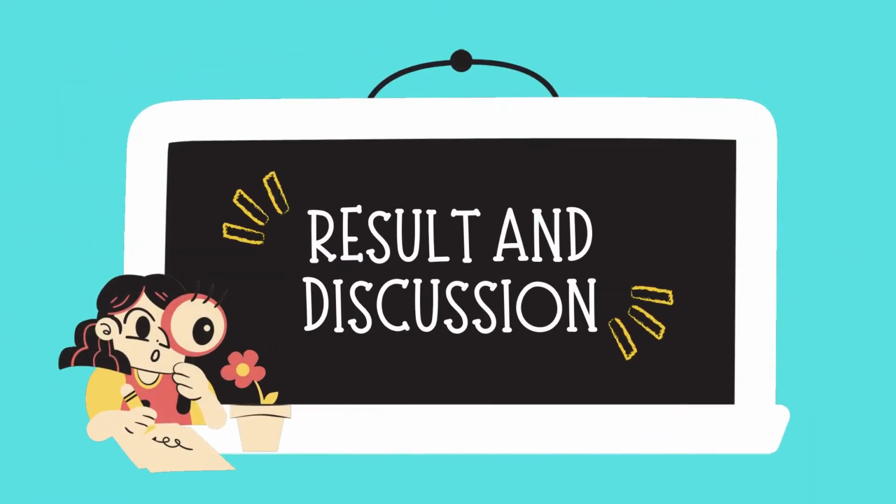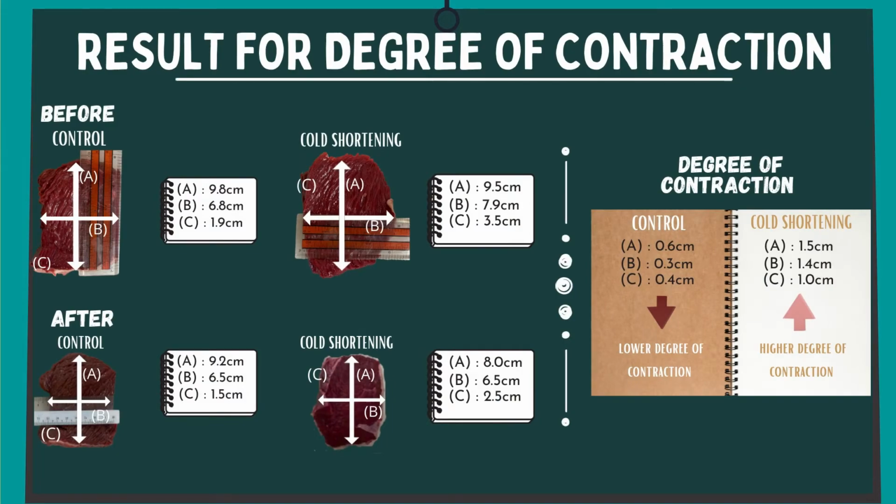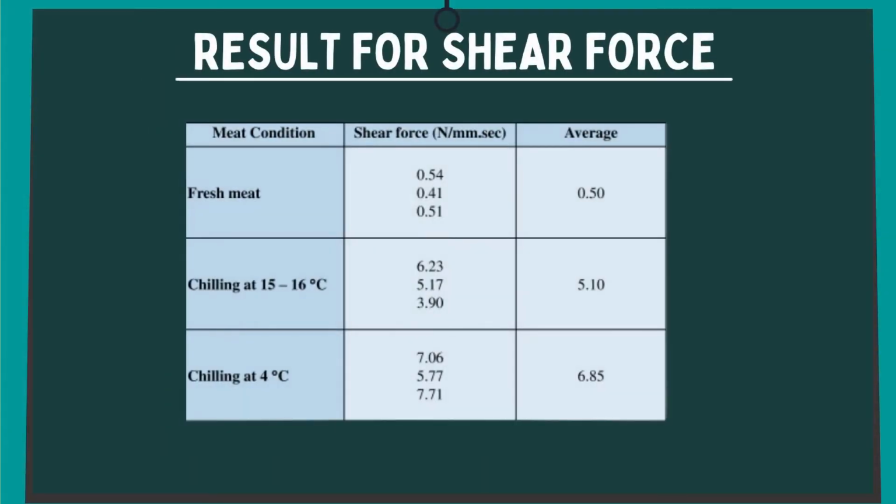This section will discuss based on the previous analysis. This is the result obtained from the degree of contraction for both meat conditions. Next is the result for shear force analysis using the texture analyzer.